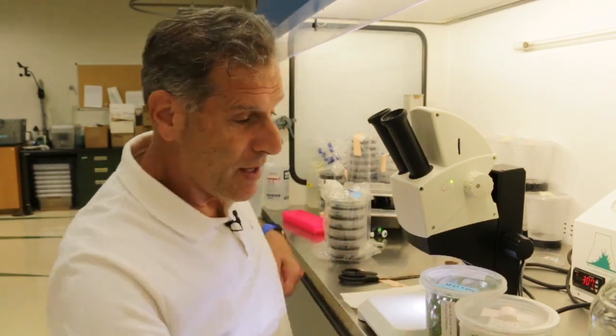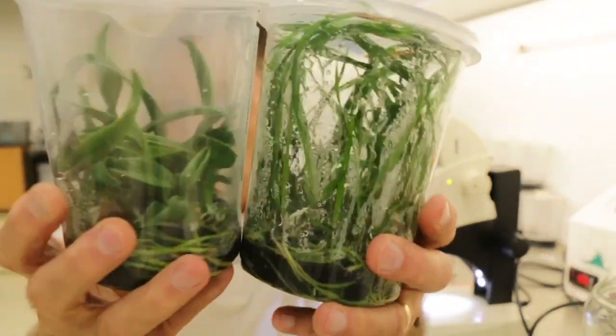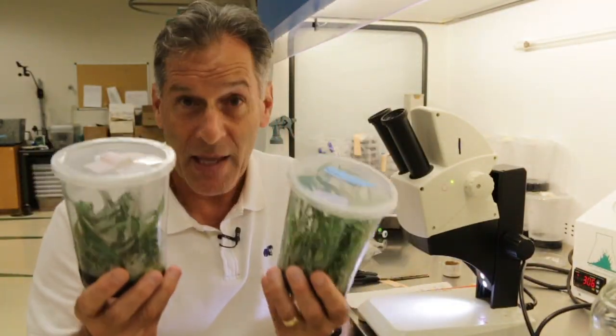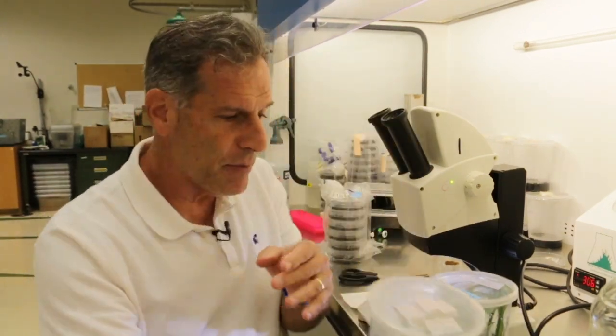It just takes so long typically for orchids to flower. I want to use what I know — how to grow plants in flasks quickly — and apply that to getting them to flower quickly. It's not just growing them at the seedling stage, but also getting them to germinate and swell up.